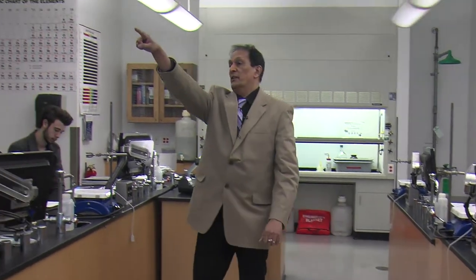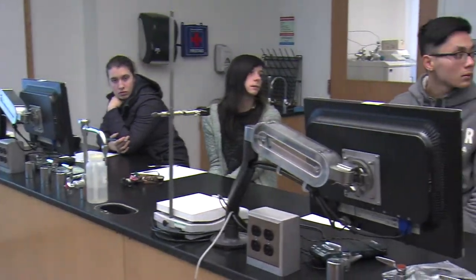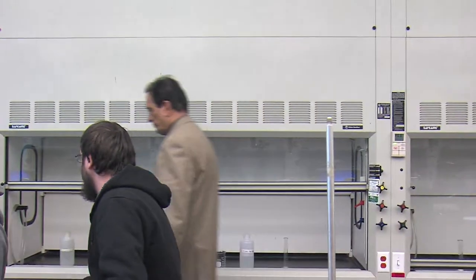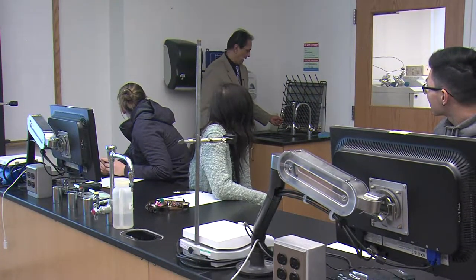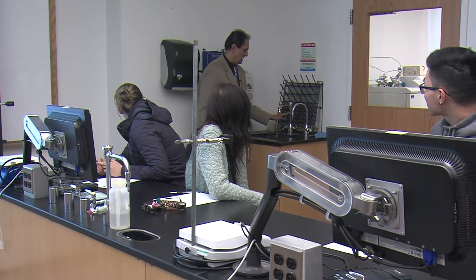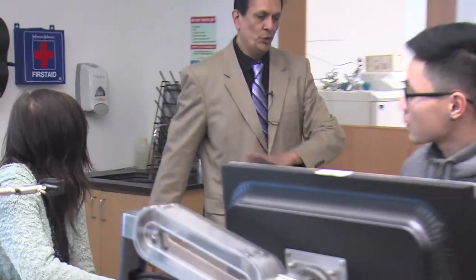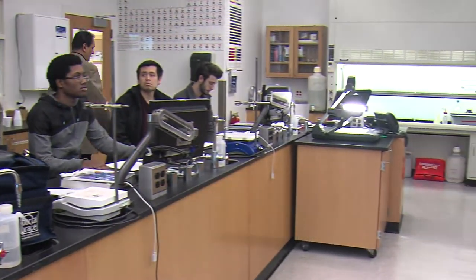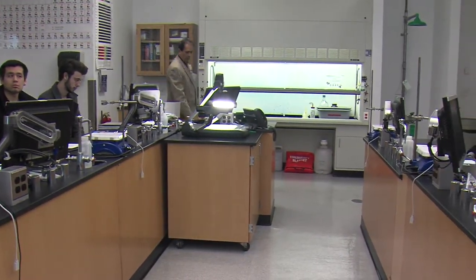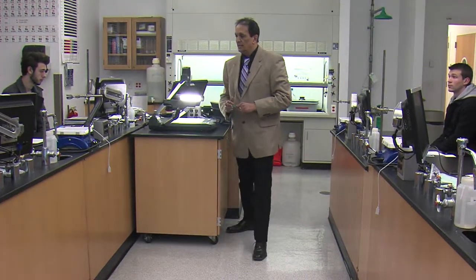The only faucet that we have is over there, okay? This is the faucet that we have, and the faucet has a red hose, all right? This is the one you're going to use to clean your glassware. This one is deionized water and it is marked deionized water. Please do not use this faucet, okay? We want to keep our tuition low, okay? $6,000 per year. If you start using the deionized water, your fees might go up, because the filter costs $200, all right? So use that.